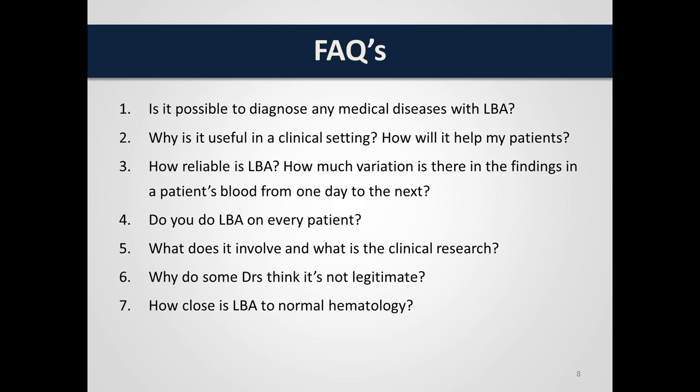In conventional hematology, the blood is drawn from a vein, it's placed in a test tube with an anticoagulant. The blood is then sent off to a laboratory where a different technician will actually look at the blood under a microscope. Before analyzing the blood, they also stain the sample and basically kill the blood cells to preserve the sample. So you can actually say that conventional hematological testing, or what they call a peripheral blood smear, is a much cruder type of analysis. It's performed on essentially dead blood at a low level of magnification.